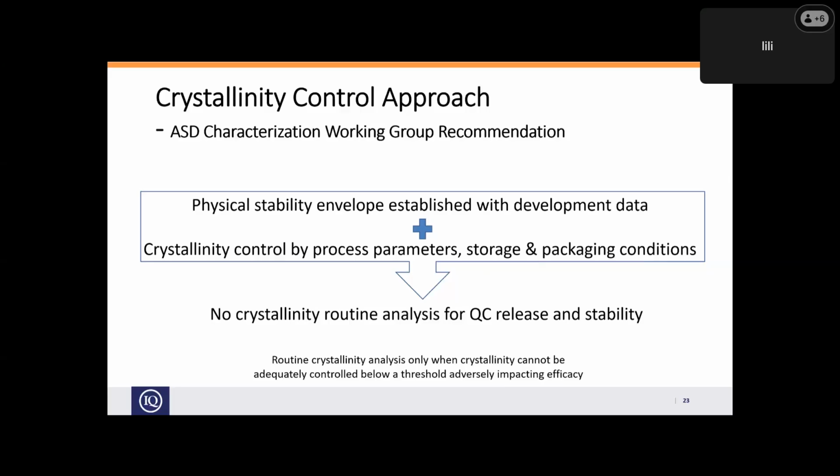There are cases where routine crystallinity analysis is still required, and typically those will be the cases where development data cannot show that crystallinity is able to be controlled below that threshold without affecting the bioperformance of the drug product.